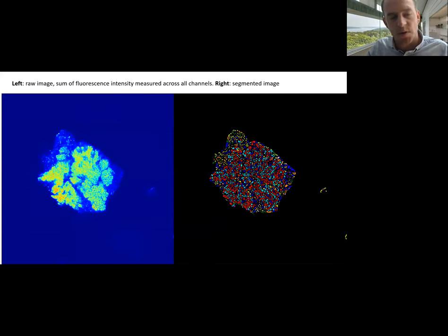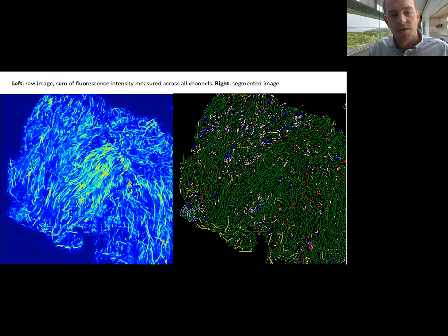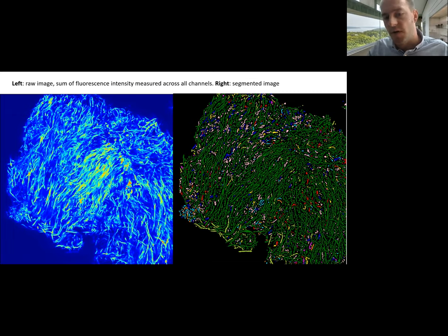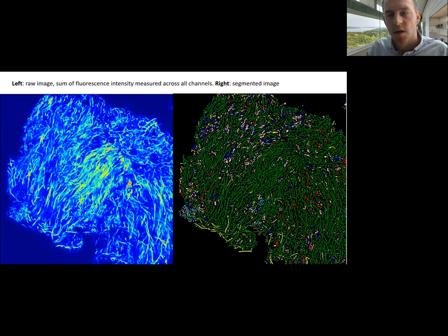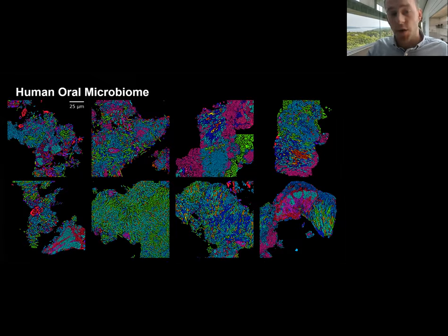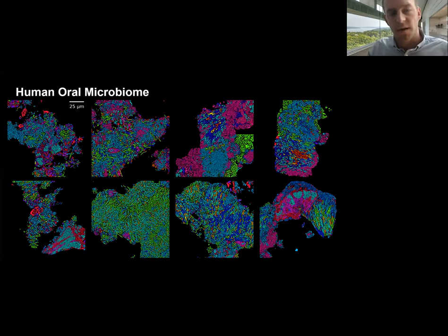Going back to the biofilm image example, this is the result of the local neighborhood enhancement algorithm that finds a seed for watershed, and then this is the watershed segmentation that results. Here are a few examples of oral biofilm patches and their segmented images, including one that nicely illustrates this technique's ability to find and segment cells with unusual shapes, which is one of the challenges given our image format. Other examples show the diversity of species and patchiness of these landscapes.